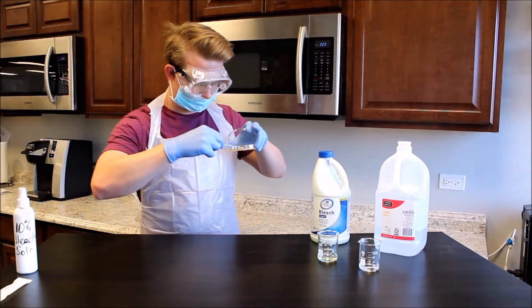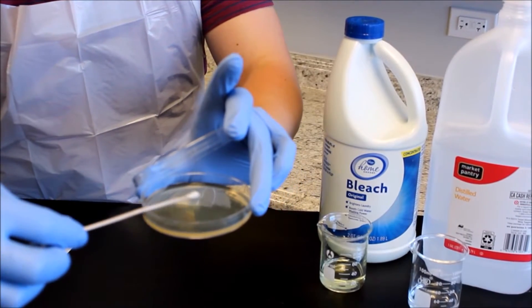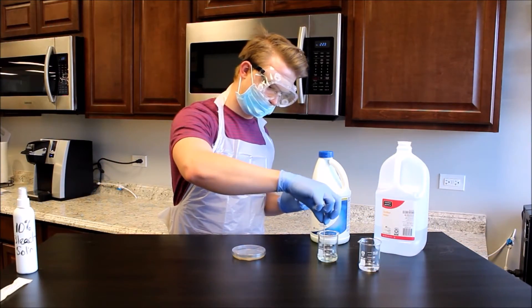Insert the swab into the opening and streak the surface of the agar with the swab. Remove the swab from the plate and immediately close the lid. Place the swab in a container of undiluted bleach.